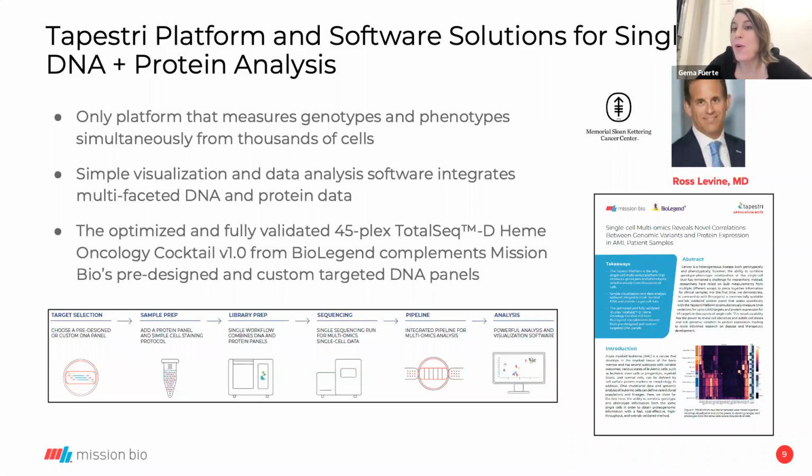So yeah, as Kelly said, we are extremely lucky and very appreciative of the work we have done together with Dr. Ross Levine for the Multiomics application note, which was the first application note we launched for this Multiomics assay. So some data of this application note is what I will show today for the live demo of Tapestry Insights. So just to give you a little bit of background, this application note has two different experiments. One of them is to showcase the 45-plex TotalSeq-D cocktail from BioLegend plus PBMCs from patient samples. And the other one is the one I'll show you on the live demo.